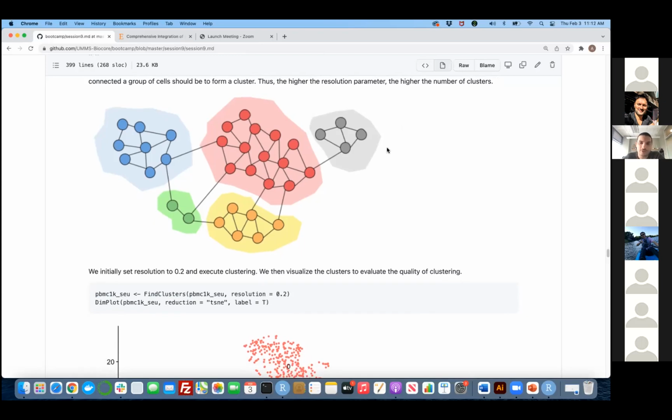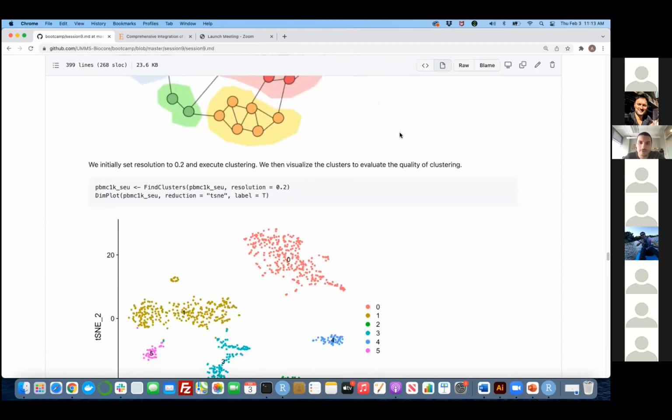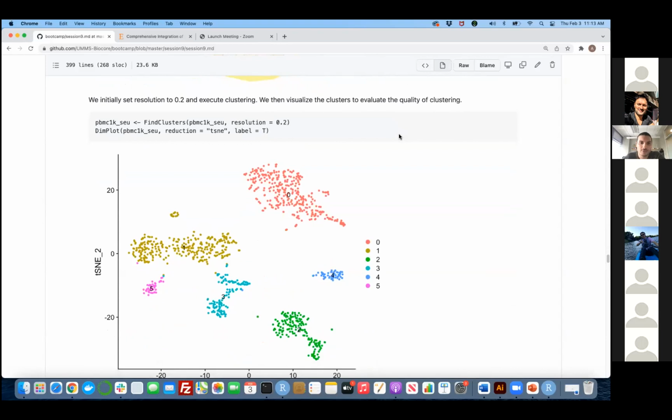You have to start with unsupervised clustering to have an unbiased opinion of the different populations you may have in your data. So in your case, I'd start with unsupervised, and maybe if I need it, I would use a supervised version as well. But most clustering algorithms are unsupervised. They are the most basic ones.